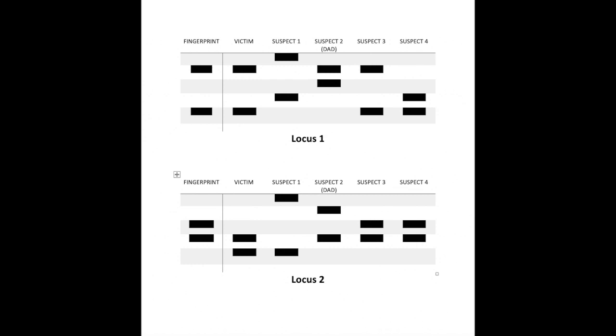To get these gels, we used electrophoresis, in which DNA is amplified and negatively charged DNA fragments migrate toward the positive pole of the gel at a rate that is inversely proportional to the fragment size. We can look at the placement of the fragments or bands on the gels to determine whose DNA was found at the crime scene.